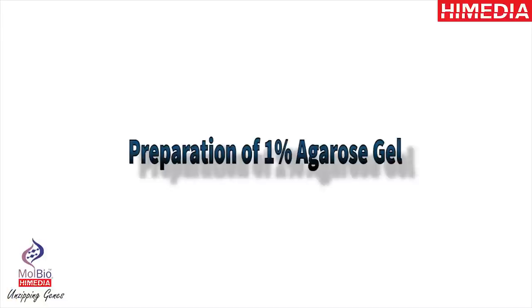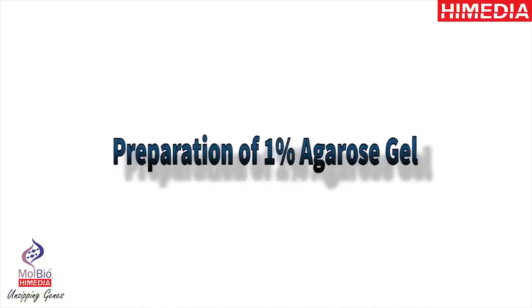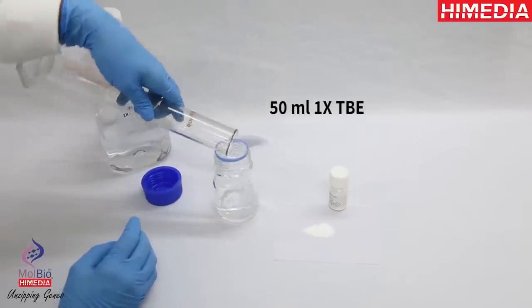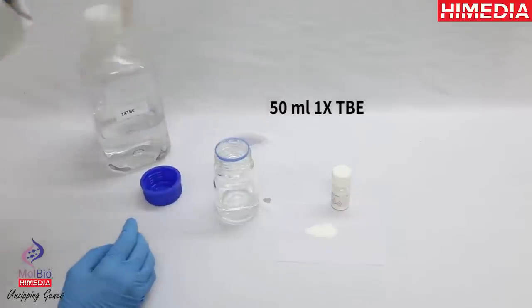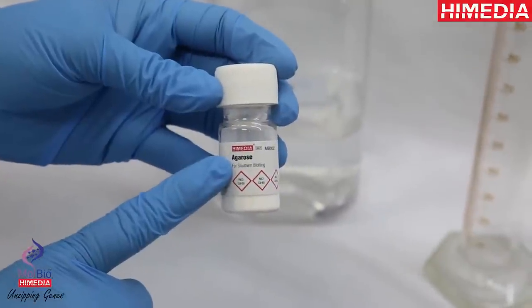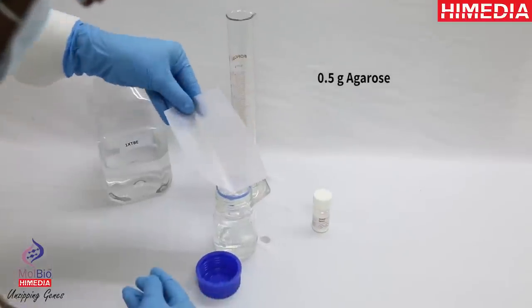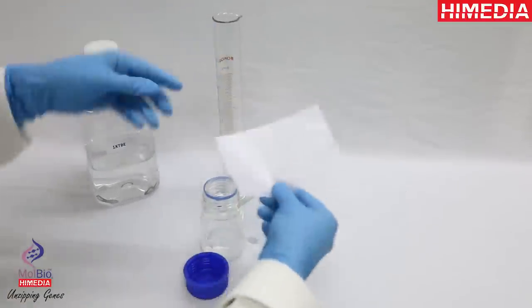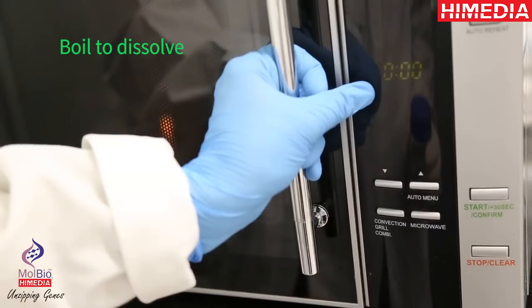1X TBE. 1X TBE. Gram agarose. Boil to dissolve.